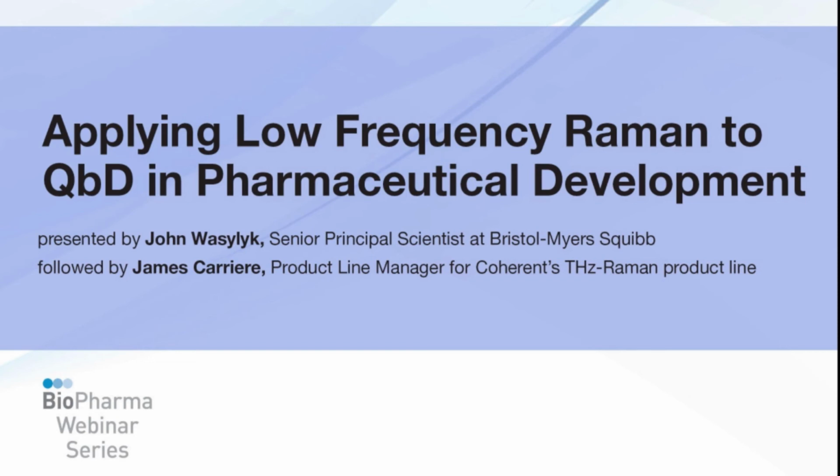In the case of non-contact Raman spectroscopy, what are the limitations on focal distance? For you, Dr. Wasylyk?